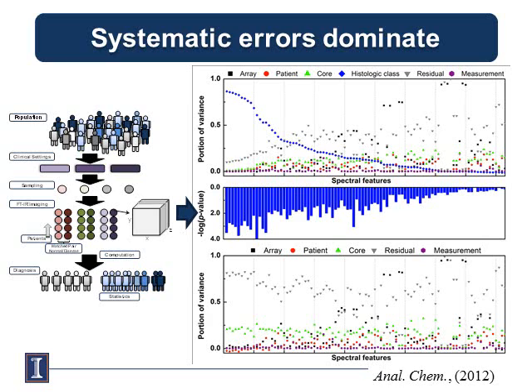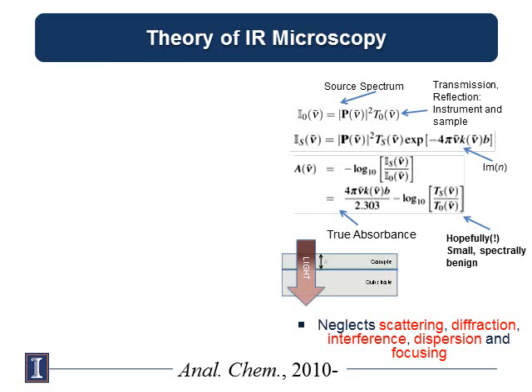And this had us confused for a while. So if you keep that in mind for a second and start looking at where the data actually comes from in the infrared, that's perhaps more interesting. I think more realistically, when I started as an assistant professor, I was convinced that I would never be funded. So I started doing theory quite a bit. And I started going philosophical. I started asking questions like, what is the basis of IR imaging, and what kind of data do we acquire, and so on. So this was a piece of evidence that we were aware of, but never could solve. At the same time, we were thinking about what are the fundamentals of IR microscopy.